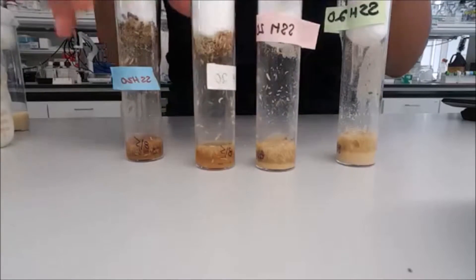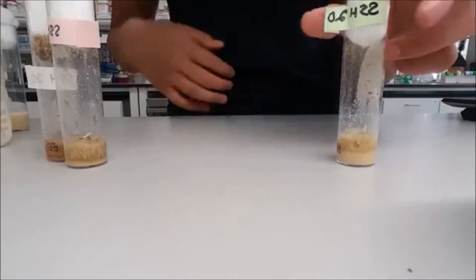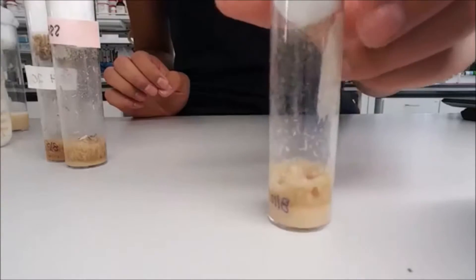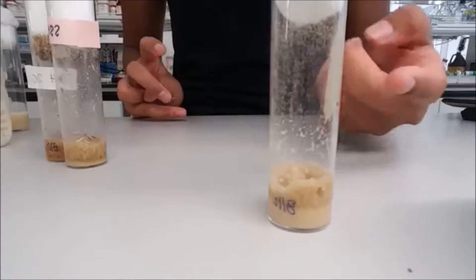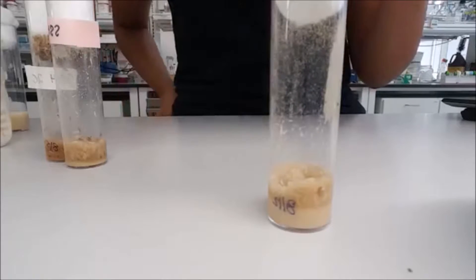You have to look at each vial individually to evaluate its health and whether it needs to be flipped or dumped. This vial needs to be left alone because there are larvae starting to develop into flies, and we need to give them more time to turn into adults. So this one we're not going to do anything to.